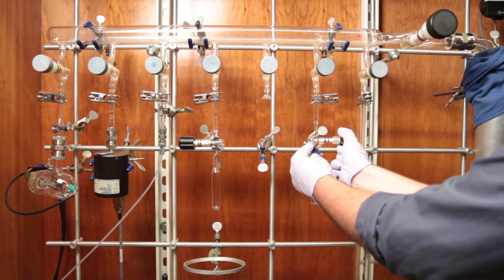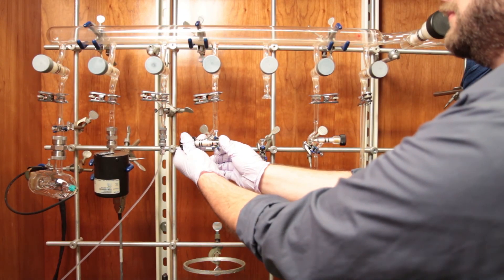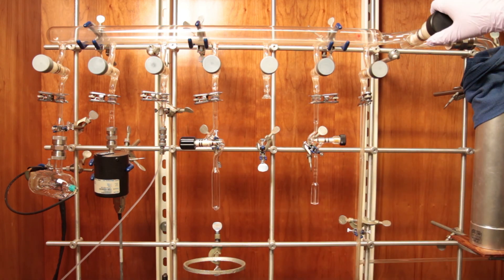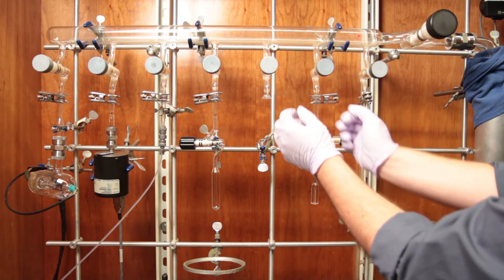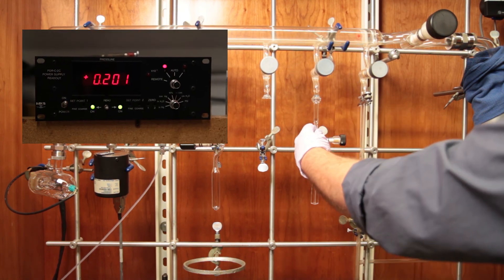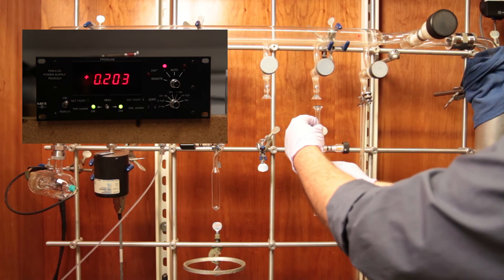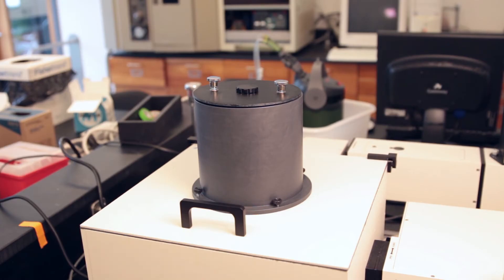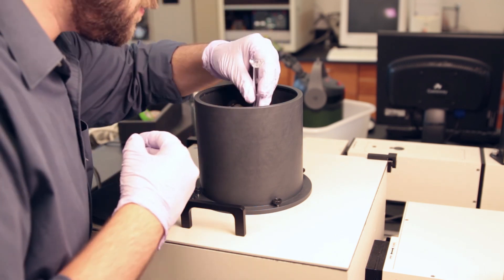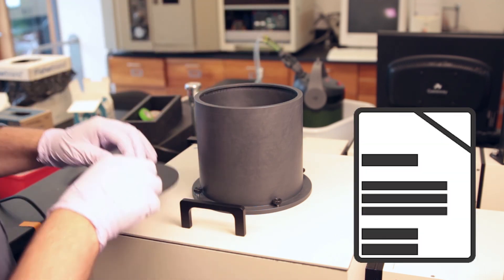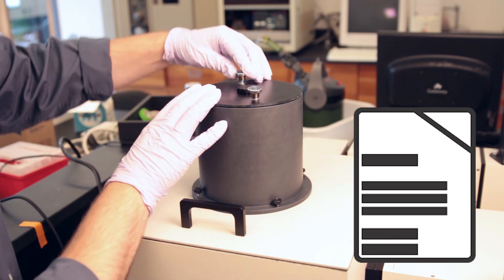With the sample degassed, we can proceed with filling our cell. At this point, the process is very similar to that of filling the cell in the HCl-DCl experiment. Our final pressure of our sample will be roughly 220 millitorr. With our sample cell filled, we can remove it from the line and acquire an emission spectrum. Please refer to the handout for further details on recording the spectrum.